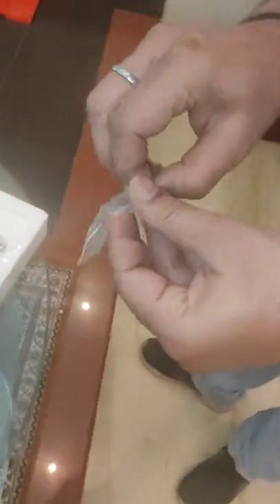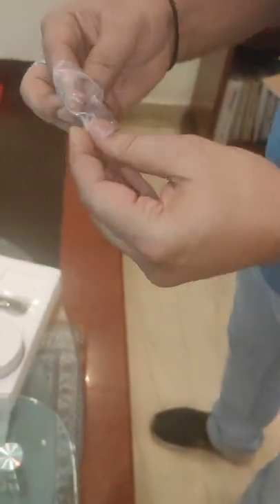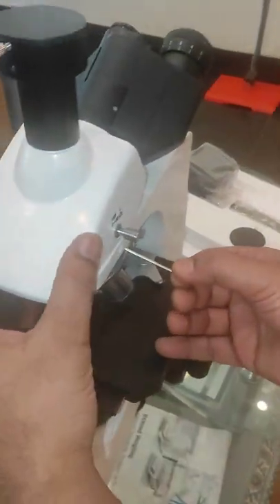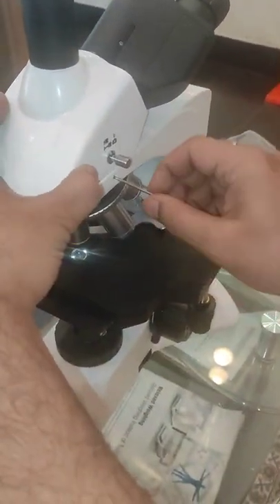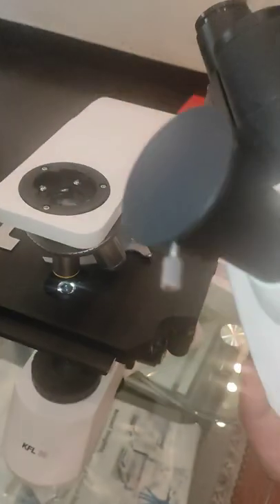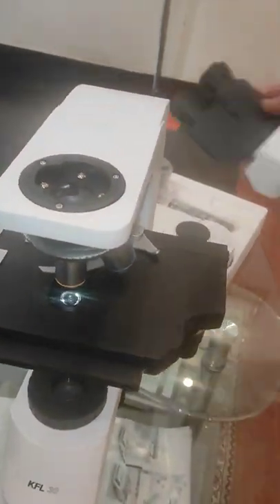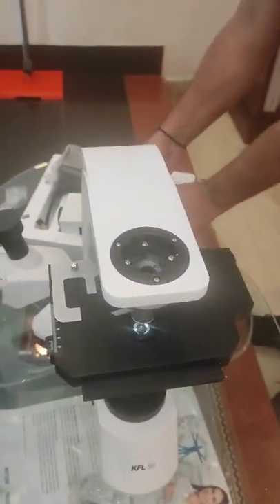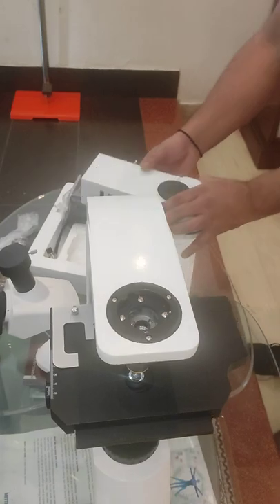Now open the Allen key. First remove the binocular head — trinocular head. Unscrew the trinocular head from the LMP, then replace the fluorescence attachment.